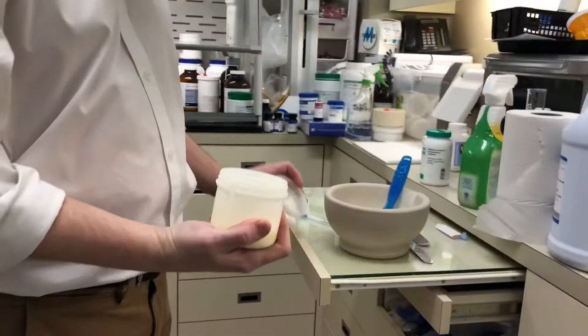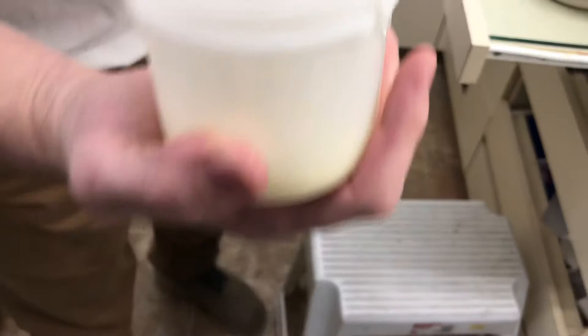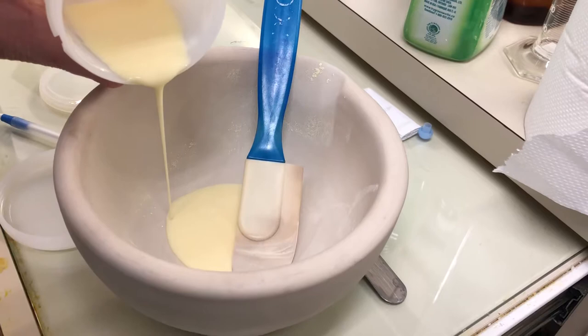Our suspension now looks very homogenous, so I'll pour it into here and you can have a better look at it. You can see no lumps, and that's how you make a suspension out of tablets.